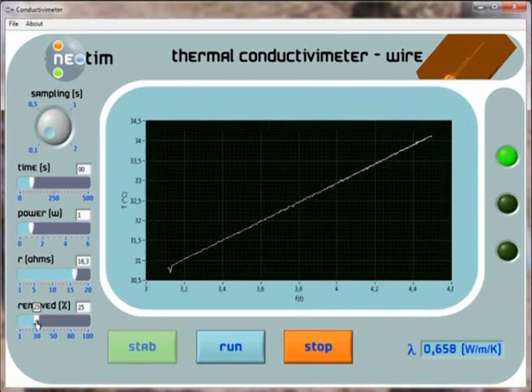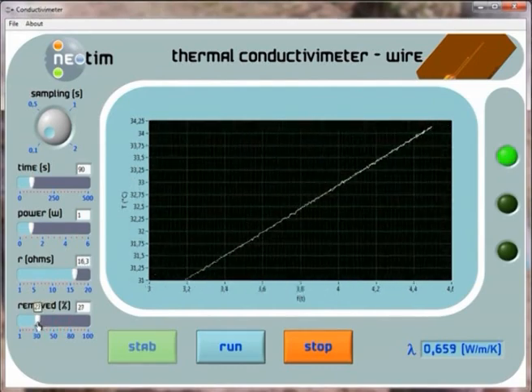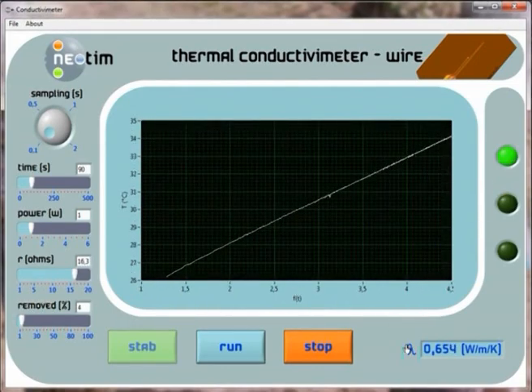When the test is complete, a light color indicates if the measure is correct. If it's green, the conductivity value displayed is right.